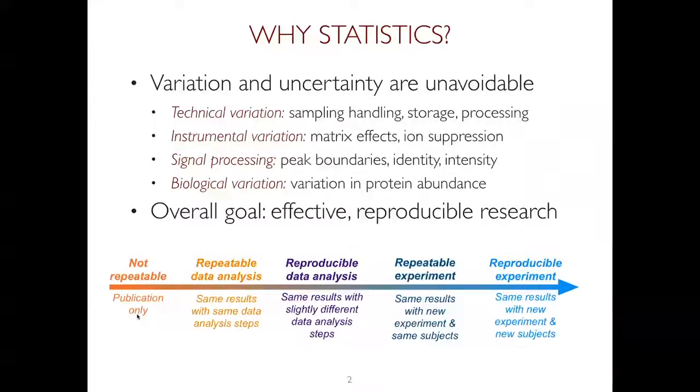And then if we think specifically about data analysis, there is repeatable data analysis, where if we have an analysis published, we want to be able to go back to the same data, repeat the same analysis steps, and get the same numbers back. And it is actually quite challenging by itself already. But it's not the only thing, because what we also want to do is to repeat the analysis, but maybe using methods which are the same in spirit, but maybe not exactly identical.